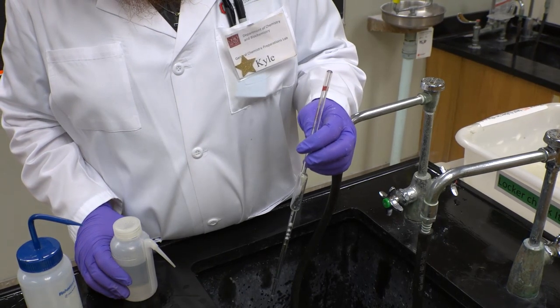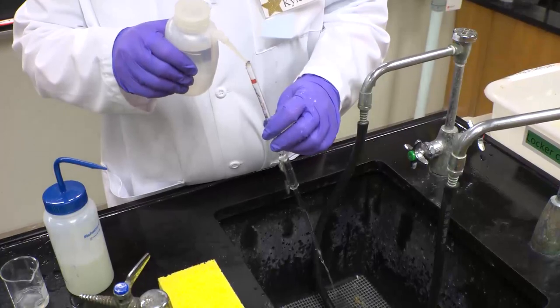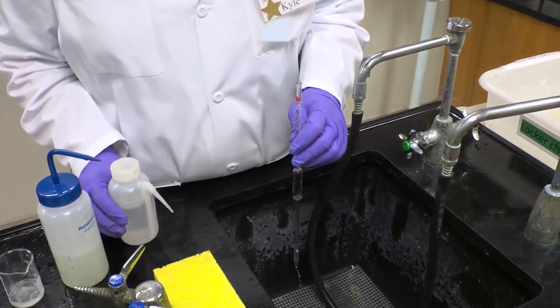It is not necessary to use a pipette bulb to rinse the pipette with water. Just use the running tap and your DI water bottle to rinse the pipette from the top to the bottom.